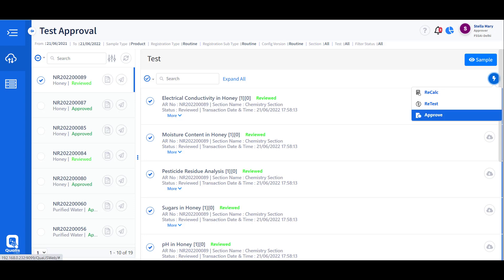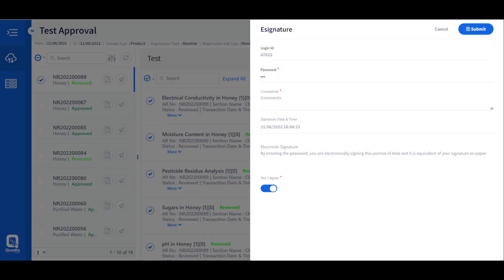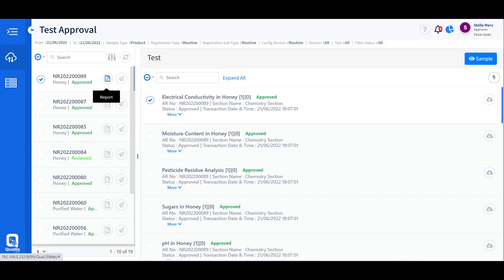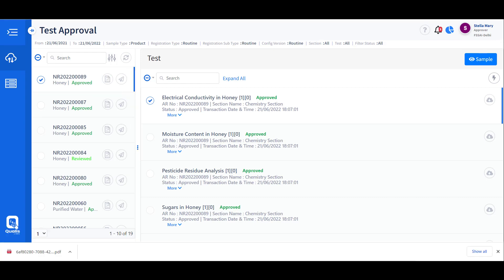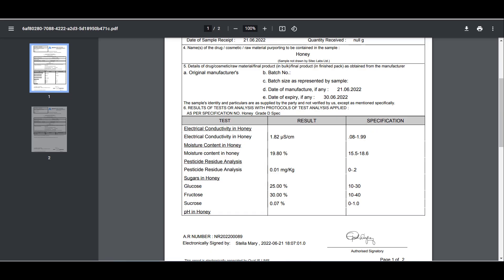When the approver is satisfied with the results, they execute the electronic signature with their decision to approve the results. Once the sample is approved, a certificate of analysis can be generated. The certificate of analysis can be embedded with the electronic signature or the scanned signature of the user who signed the final results.